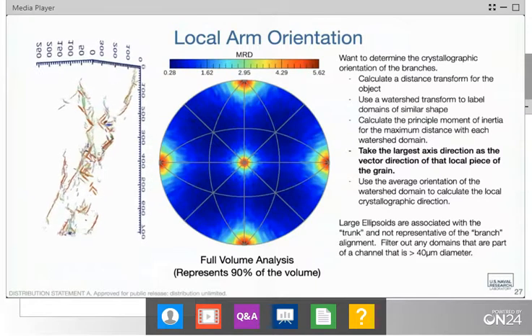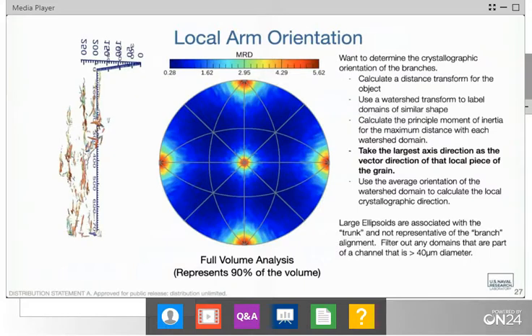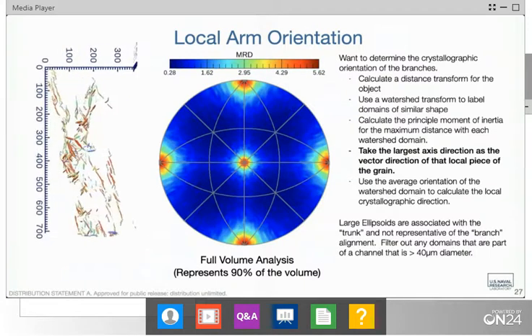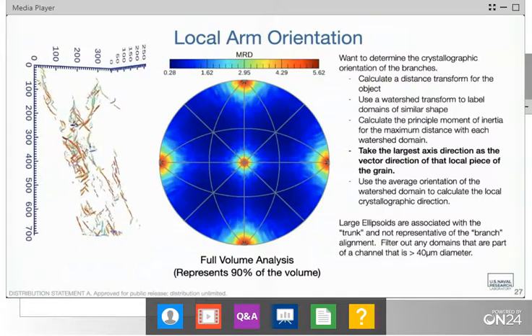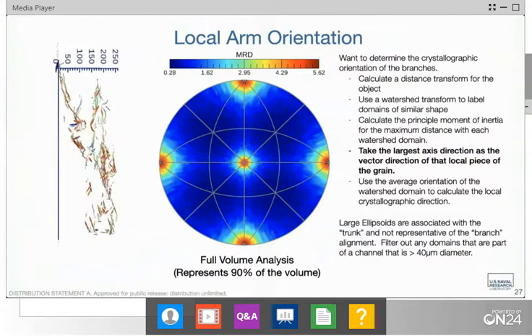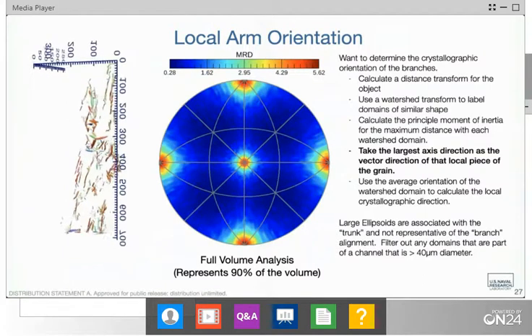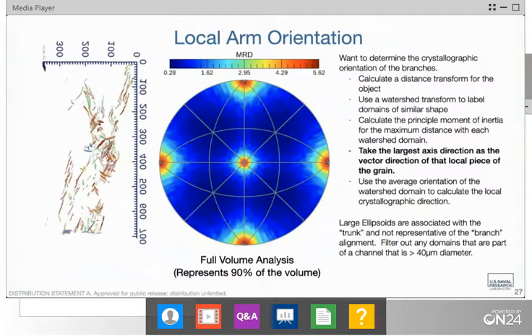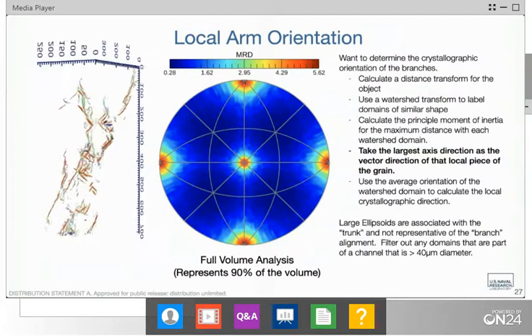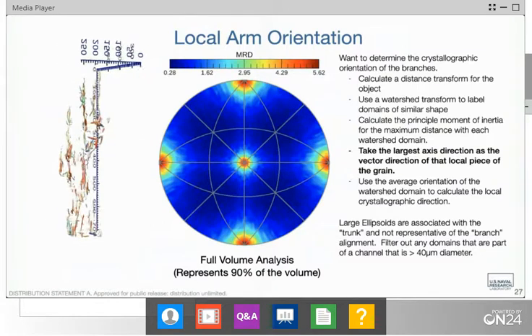One of the things when we were designing this whole thing was a philosophy of: if the system ever feels confused, please come get a human. And so that's very much built into how everything works. We actually have something that will notify us on our mobile phones that if the machine gets confused, please come check on me. We can often just dial in remotely and maybe solve the problem. Sometimes we have to be there in person.